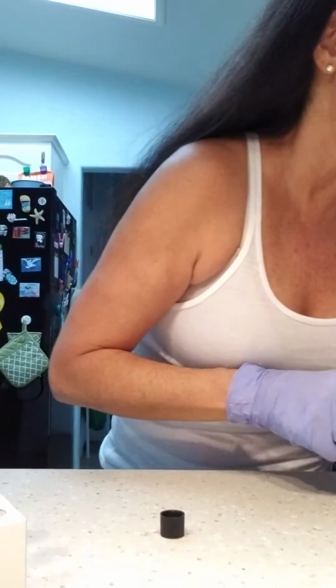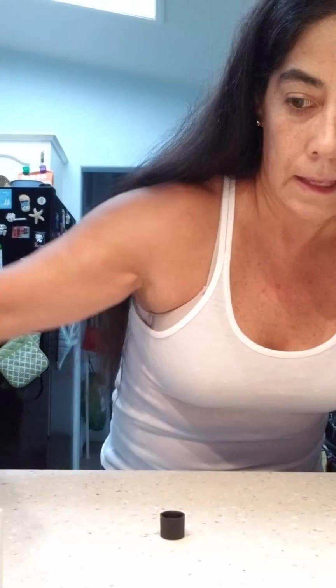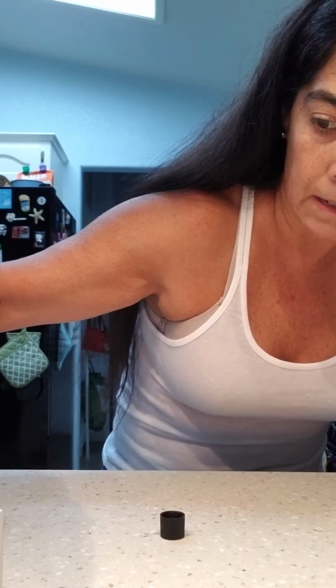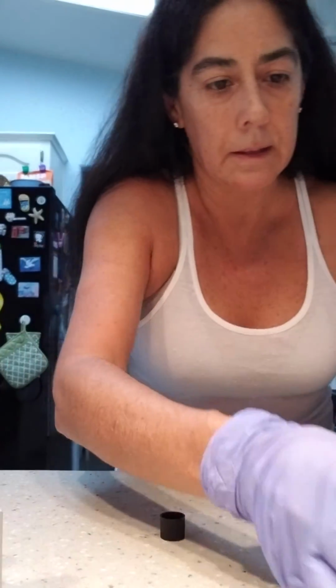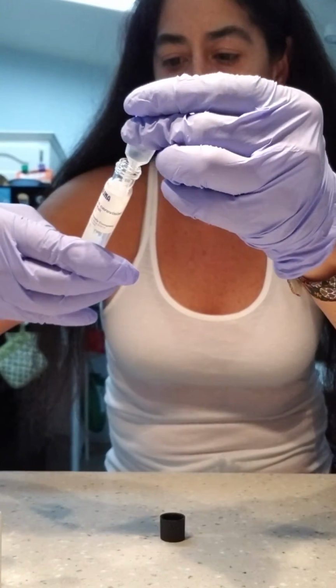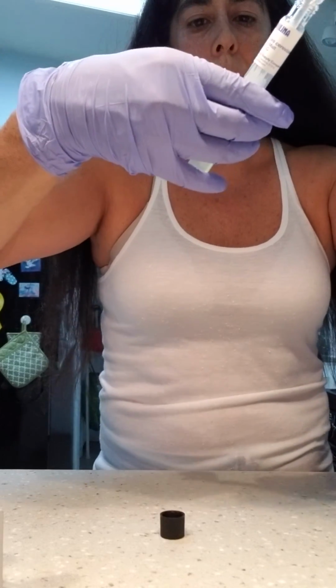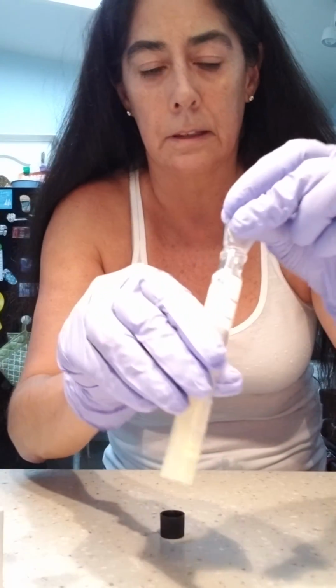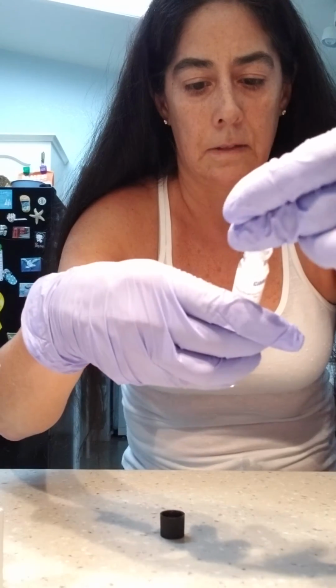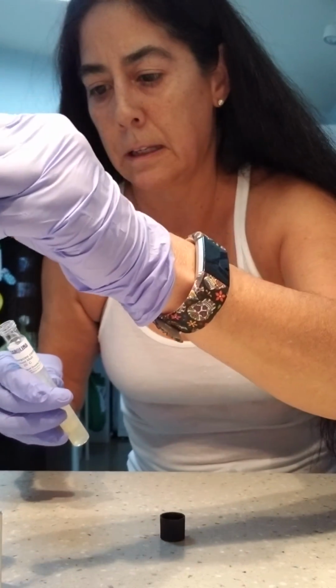So now I am going to take 1 pipette and make sure I have the correct one. Okay, well this is for the Cerevisiae, and it's very difficult to get it out, so hopefully I'm going to be able to.